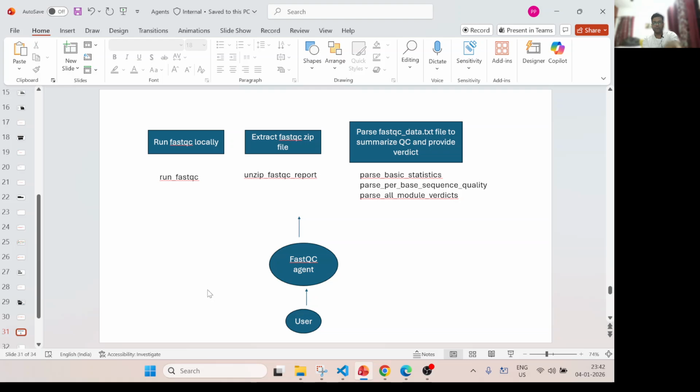Okay, so I hope this use case was useful, and I really enjoyed doing this, and I learned how the agent thinks and makes its mistakes, trying many things. So I like this use case.